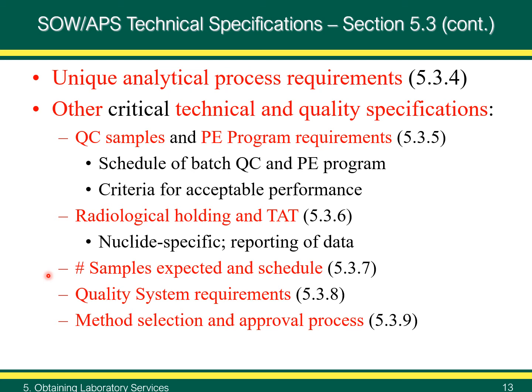This information is important to evaluate the radioanalytical method proposed and the allocation of staff and equipment resources. Also, in order to ensure that they can meet TAT commitments, commercial laboratories must plan sufficient sample processing capacity for multiple clients sending samples at the same time.